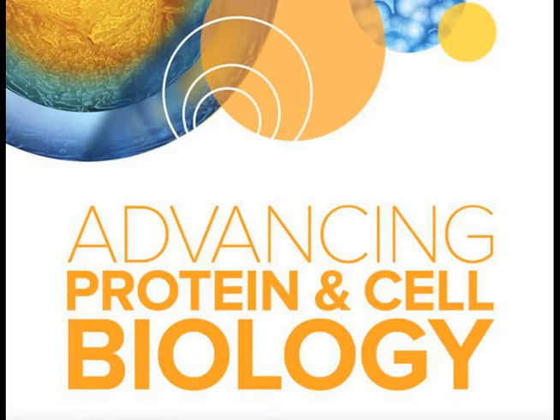A different question is, can you discuss a little bit about your staining procedure and how you added the dyes and whether you removed them and things like that? Mm-hmm. This is another important topic, because those spheroids are not attached to the bottom. There are some challenges for staining and washing. So the protocol which we developed includes just single-step addition of dyes. Usually we add a 3x concentrated dye mix in PBS directly to the wells without removal of media or anything, and we allow at least 2 hours for staining.